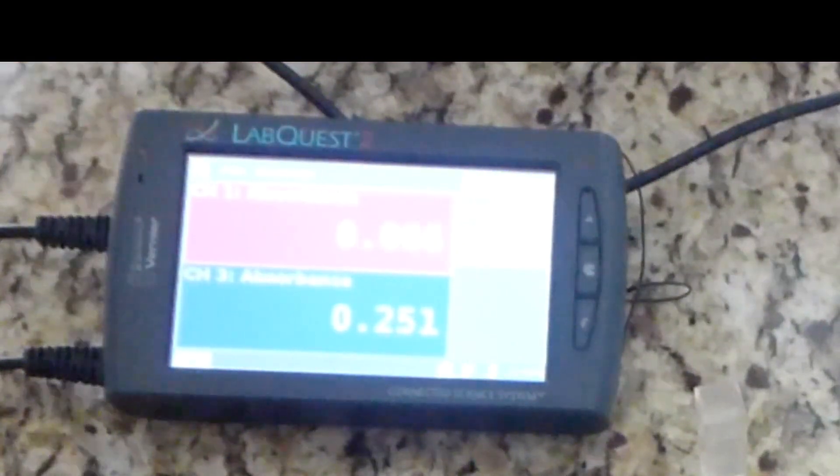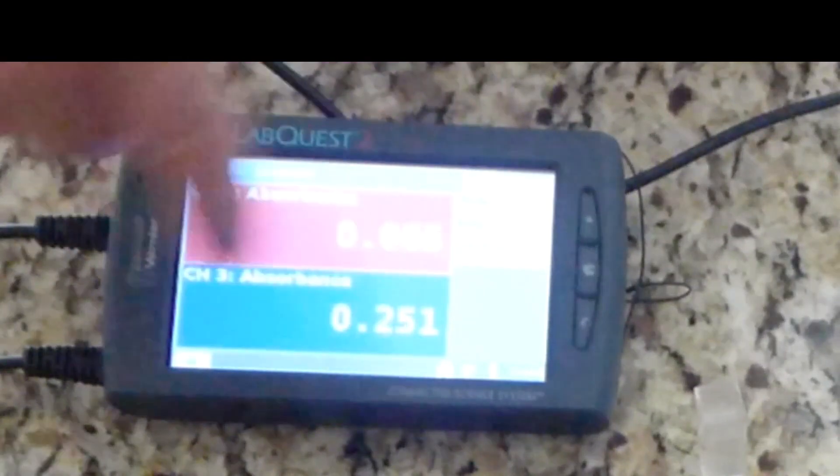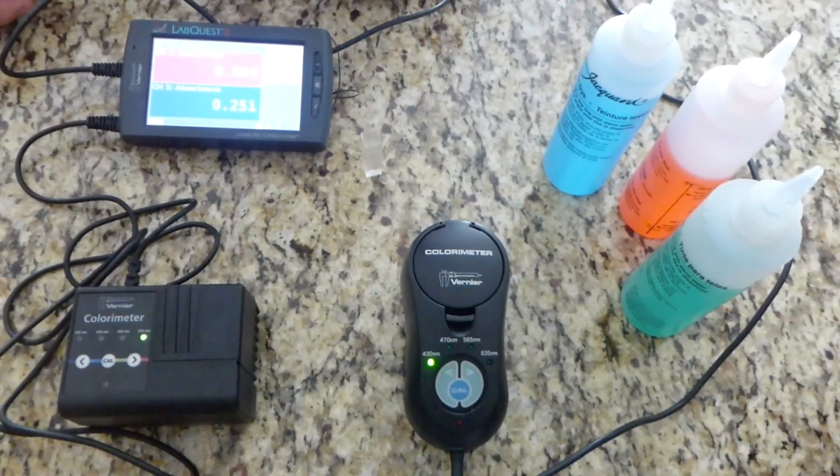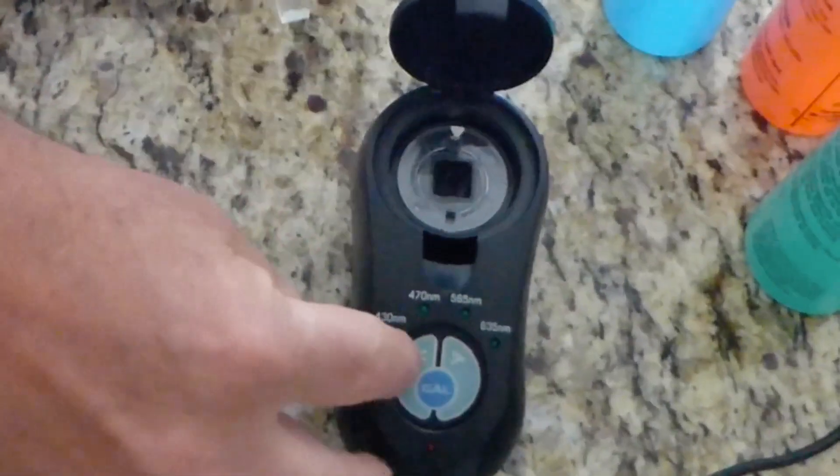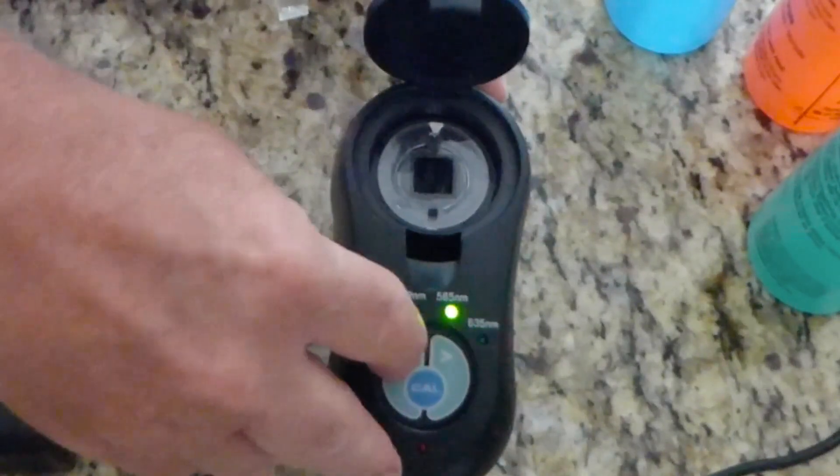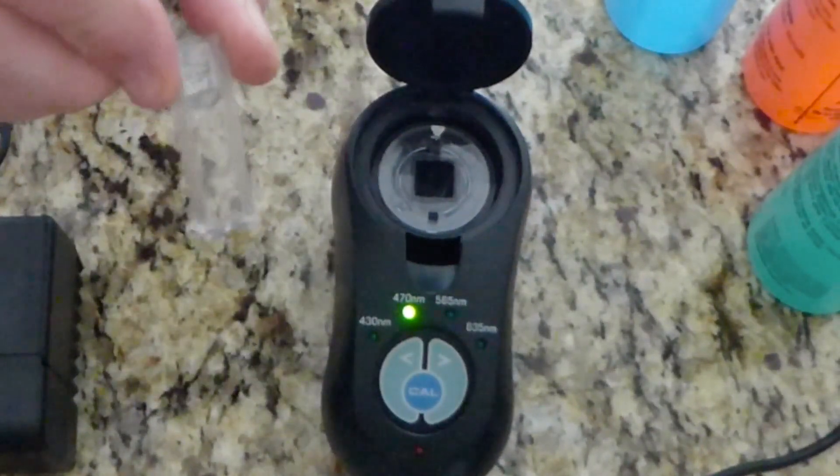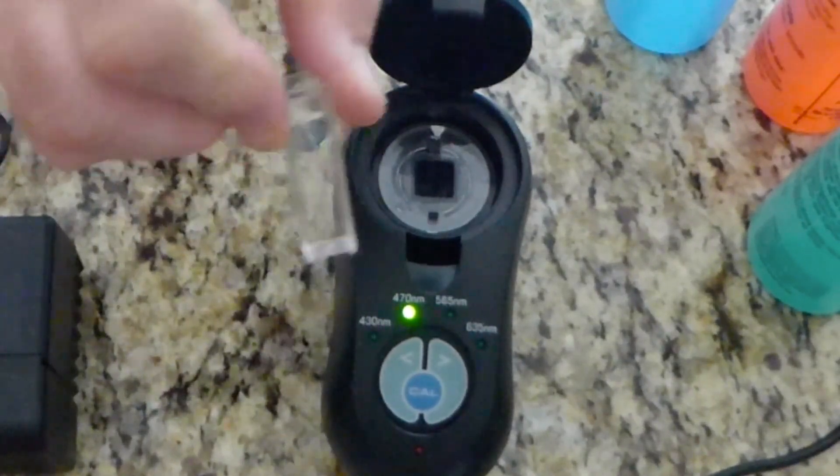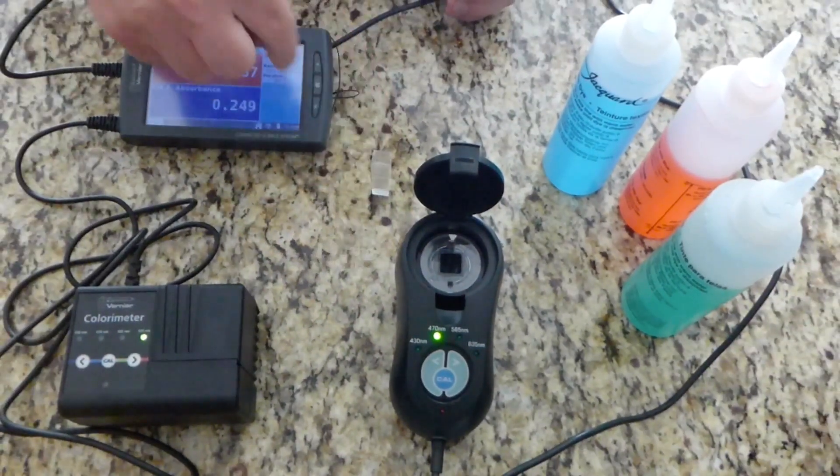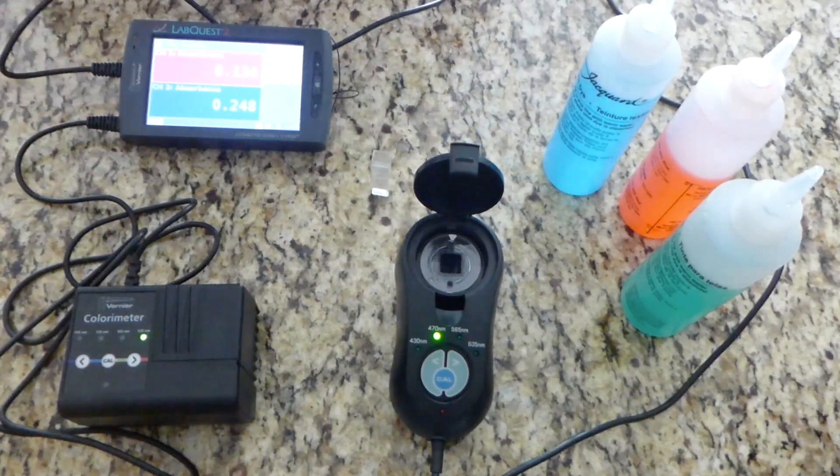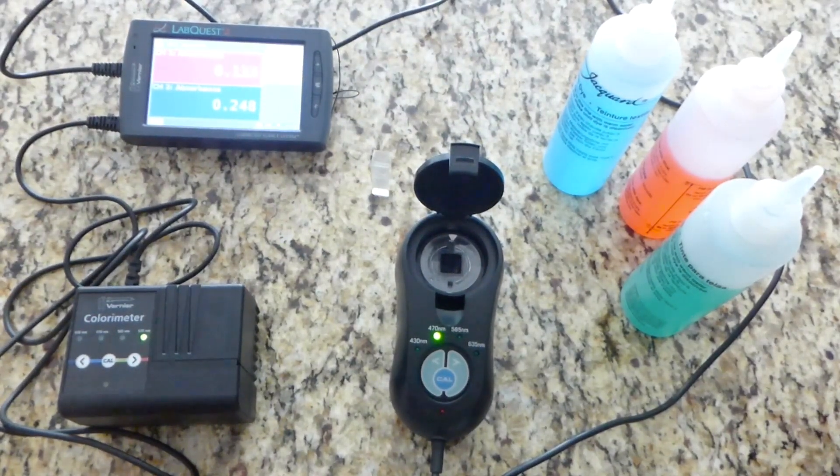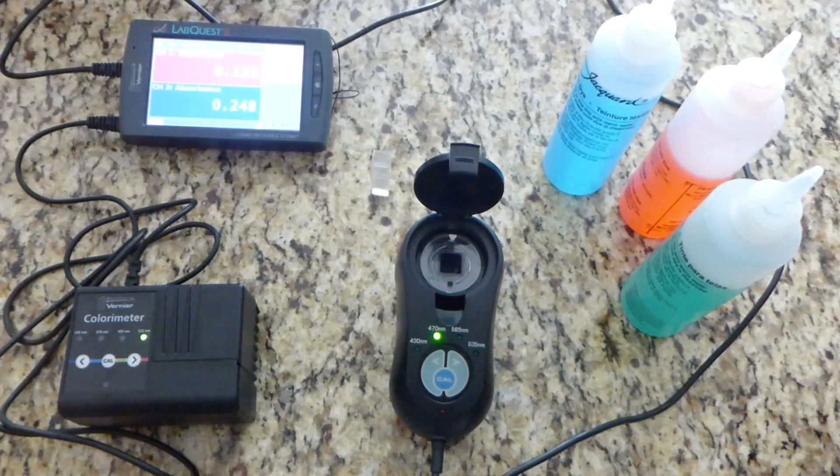We'll also put one in the other one. I want you to notice that the two cuvettes are reading two different wavelengths. To change wavelength, you just push the button to select a different wavelength. You'll have to recalibrate it before you can use it. So, again, you would pop the water in and push cal, and then you could take the new reading at the new wavelength.